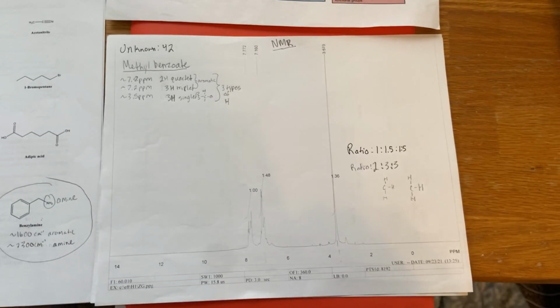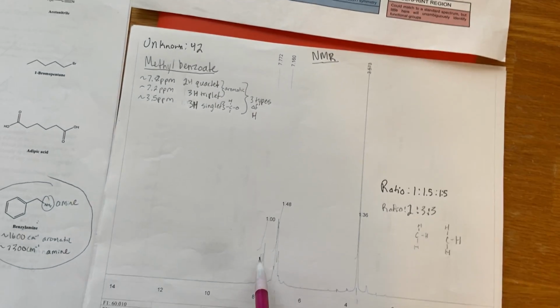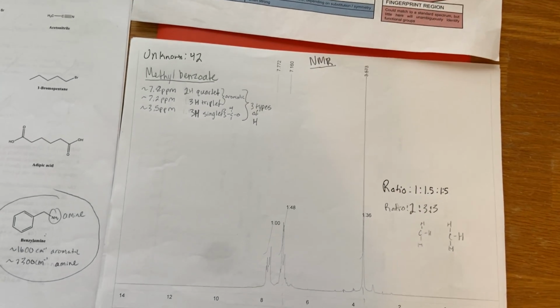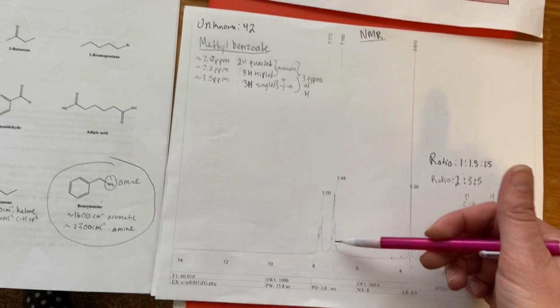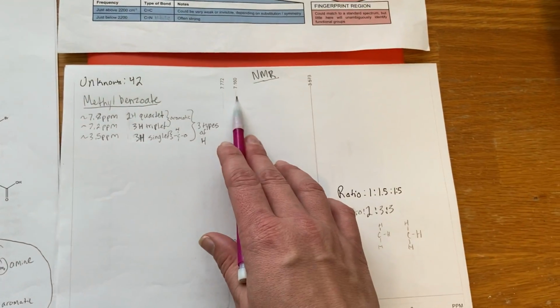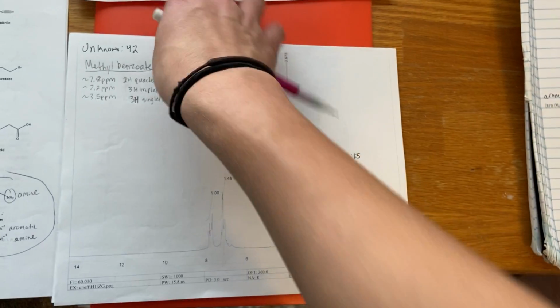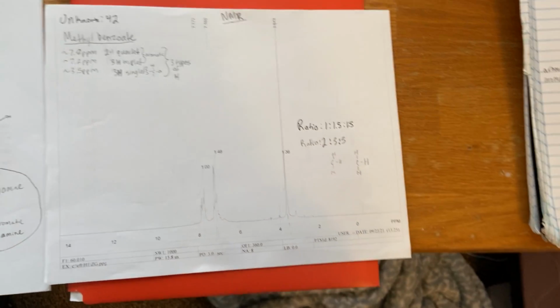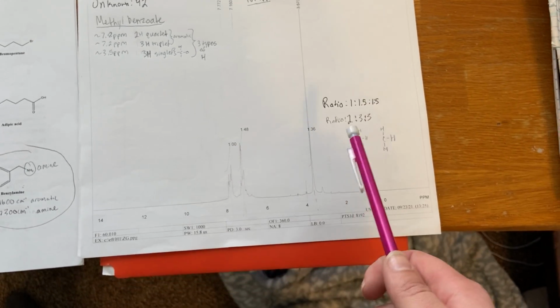And we did actions on the computer in order to find the integrals under each of these, and to find exactly where they line up, so we could see that at the top of our spectrum as well. Once we did that on the computer, the printout of the graph was then created, and this is what I have right here.